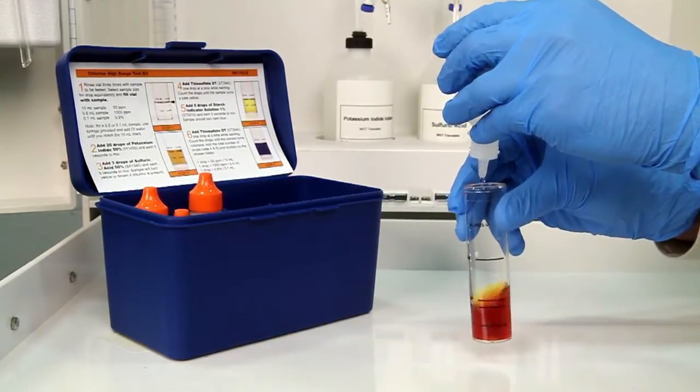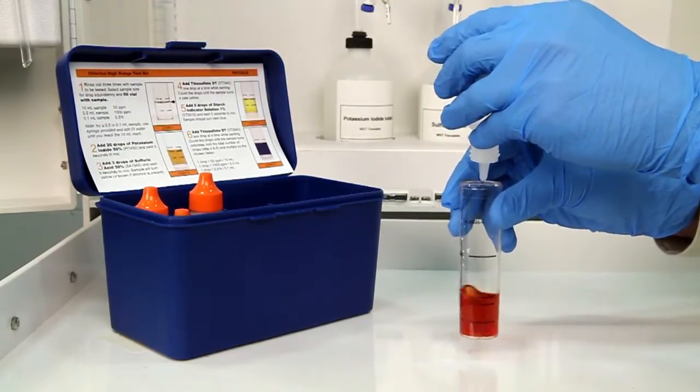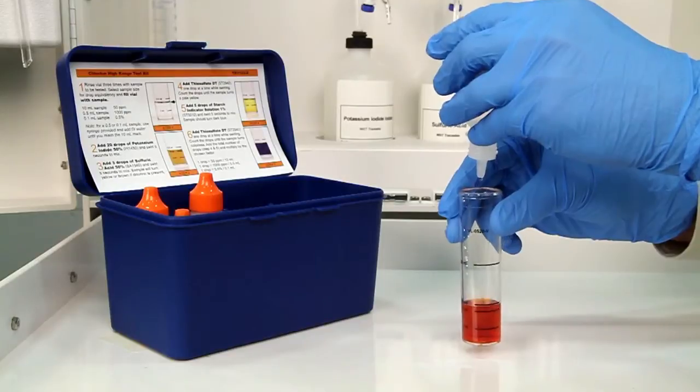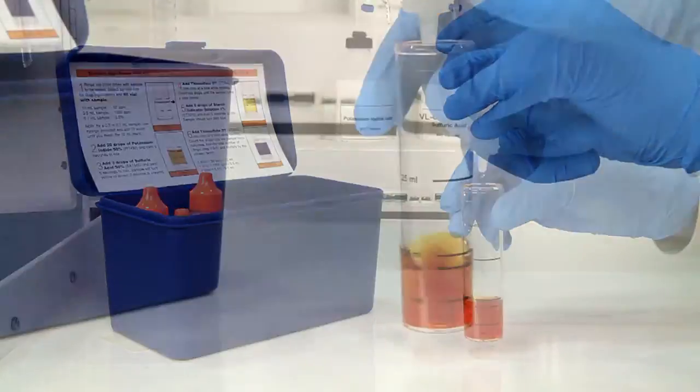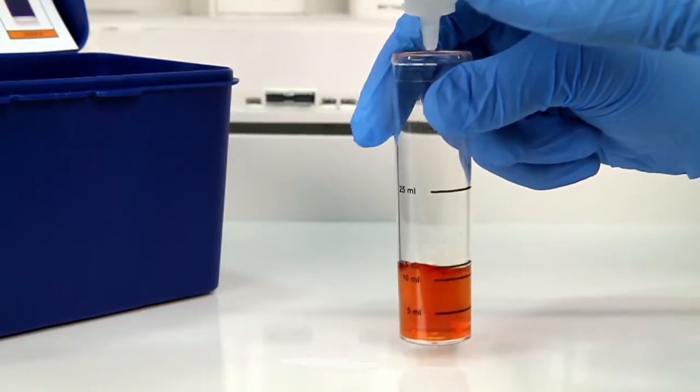The bottle contains a dropper tip, so it's important to hold the bottle vertically to get a consistent drop size. After the addition of each drop of titrant, swirl the vial to make sure the sample is properly mixed. Count the number of drops during this step.